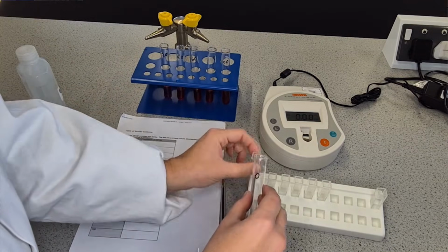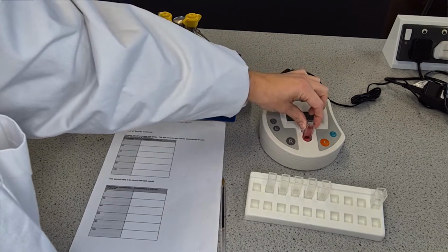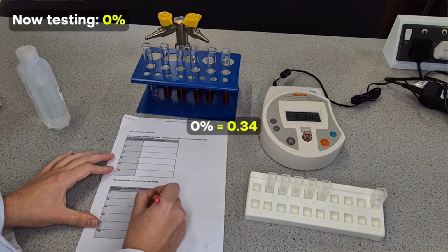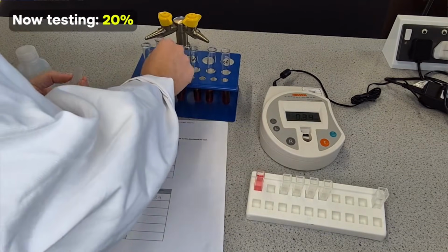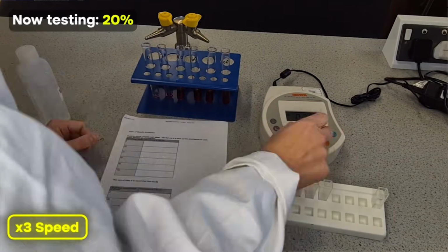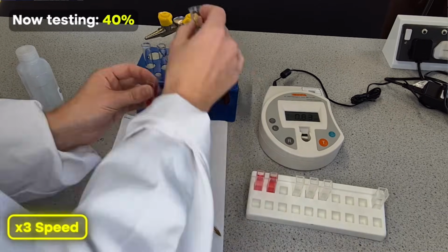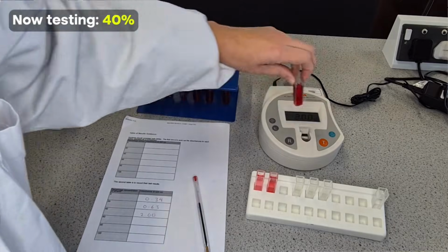So now I'm going to pour in my 0, making sure I'm only touching on the edges. Put it in so it clicks. T for test. And my absorbance is 0.34. Next then 20%. 0.63. 40%, 2, which I think is actually the maximum.